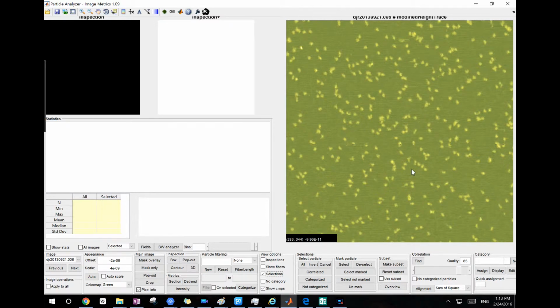And those alignment parameters and the correlation coefficient are calculated in image processor. So in particle analyzer, it's basically to extract those rotational parameters, those correlation coefficient parameters, and make alignments and then do the averaging. That's what particle analyzer does.